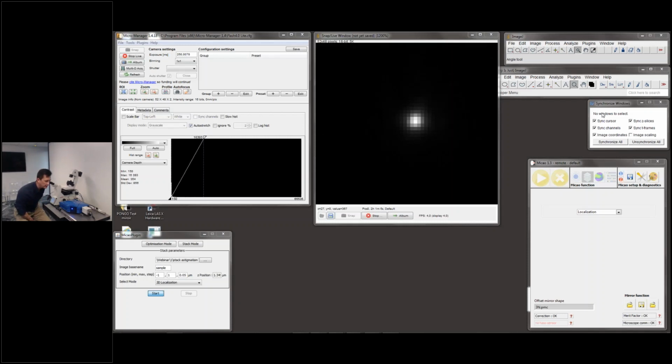As Vincent described already, this device can do a couple of things to improve the imaging quality. First, by correcting system aberrations, so-called aberrations which are coming from the objective or other optics inside the microscope, you can already improve the quality of your PSF and the number of counts in the focus.